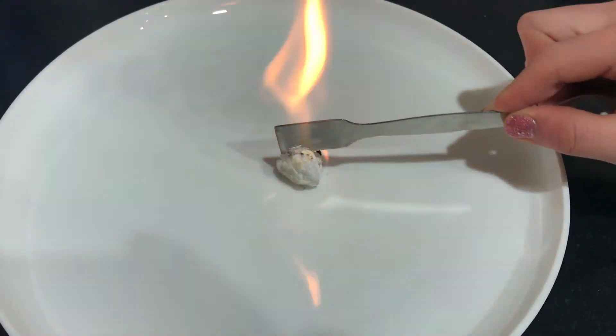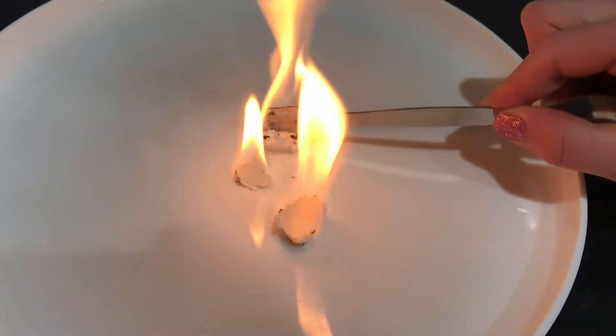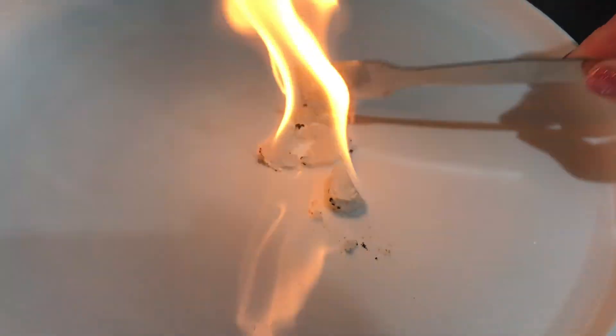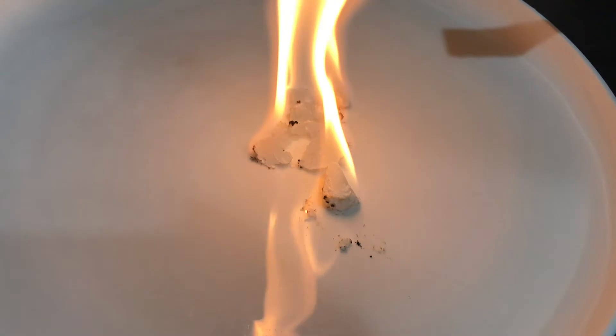When the isopropanol alcohol burns, it releases CO2 and H2O. When the acetate decomposes, it makes carbonate and acetone. When the acetone burns, it will make more CO2 and H2O.